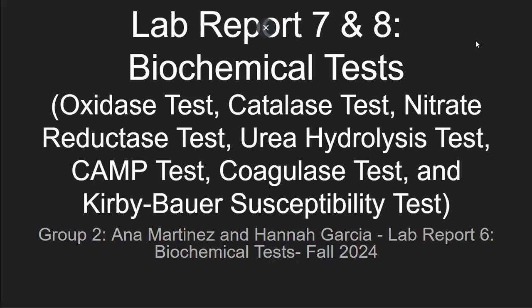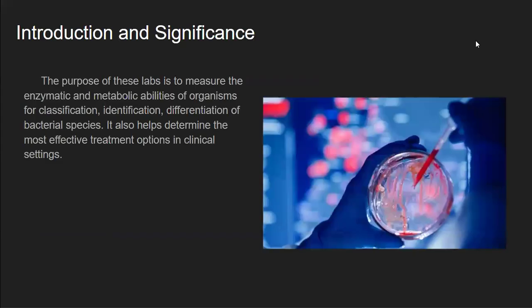Howdy, this is lab report 7 and 8, biochemical tests: oxidase test, catalase test, nitrate reductase test, urea hydrolysis test, CAMP test, coagulase test, and Kirby-Bauer susceptibility test. Group 2, Ana Martinez and Hannah Garcia, Lab Report 6, Biochemical Tests, Fall 2024.